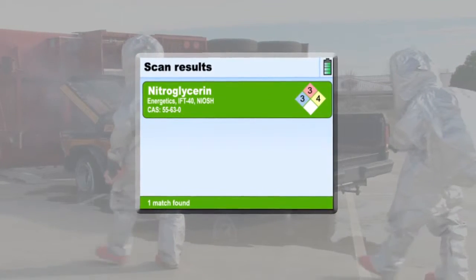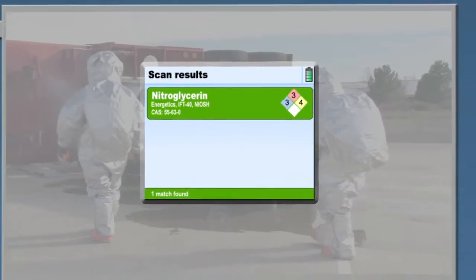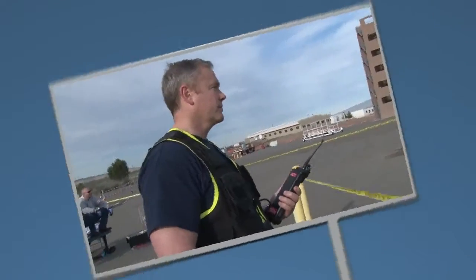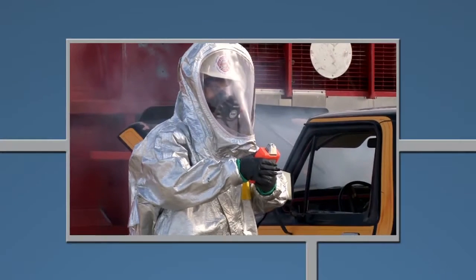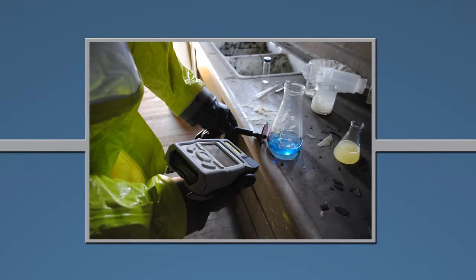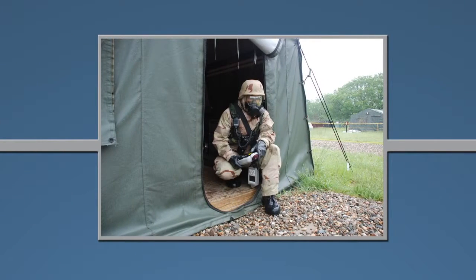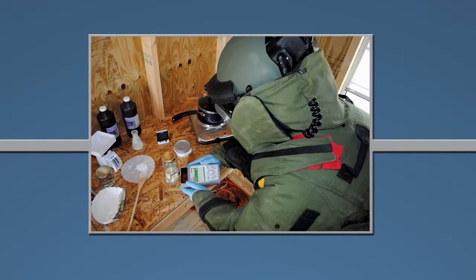Automatic mixture analysis with every scan ensures reliable identification for complex mixed chemicals without user interpretation. The intuitive interface ensures easy identification of unknowns, allowing users to focus on their mission.